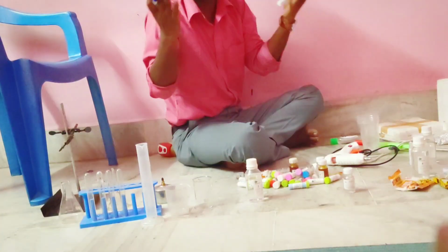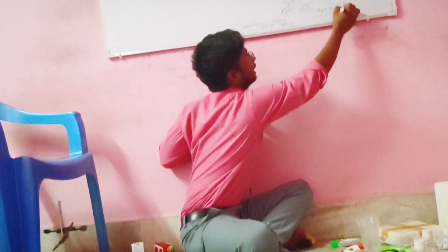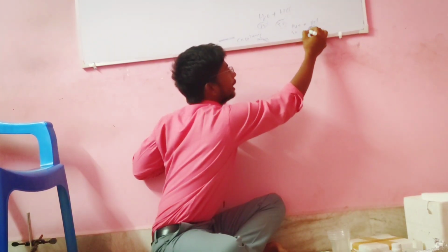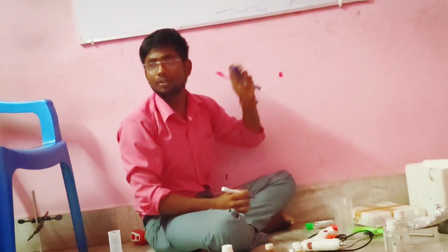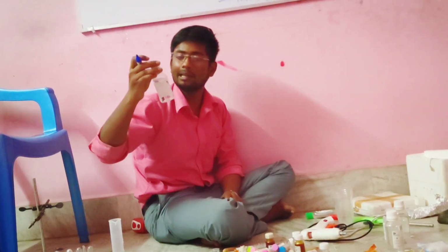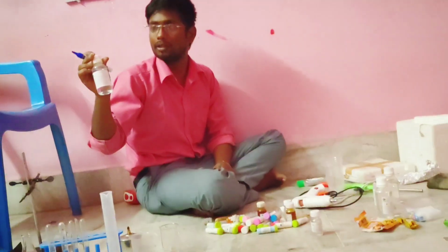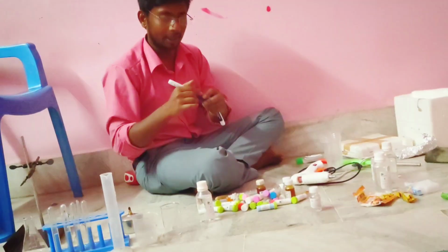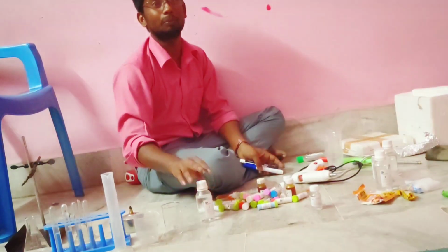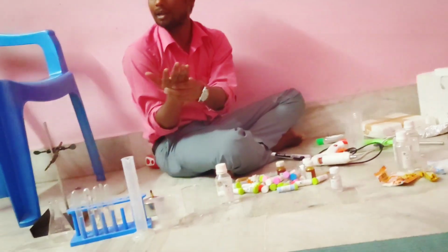But if I am talking about the concentrated HCl, definitely the amount of H2O will be less, like you can think 40, and the amount of HCl will be much greater, 60 ml. So at that moment we cannot touch them. Now we can easily touch that with open eyes. Definitely there will be no dangerous thing. But if I'm talking about the concentrated, you cannot. Even you have to put gloves on your hand. Just simply think about that.